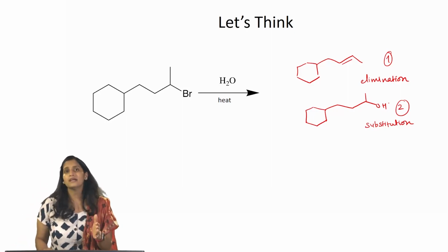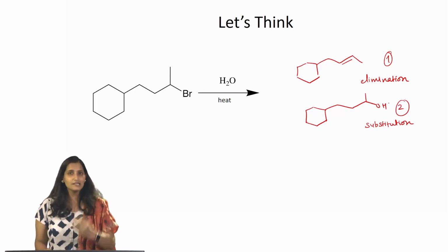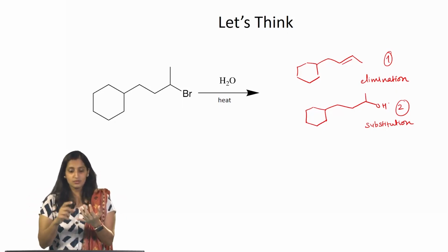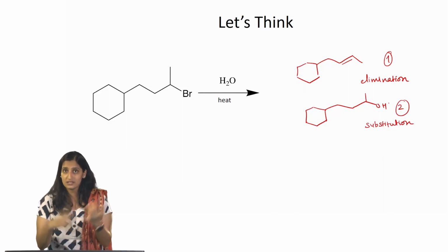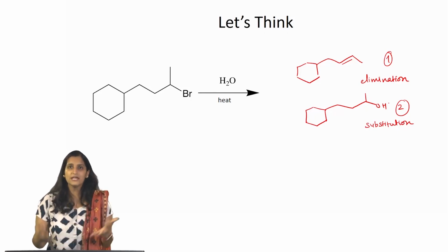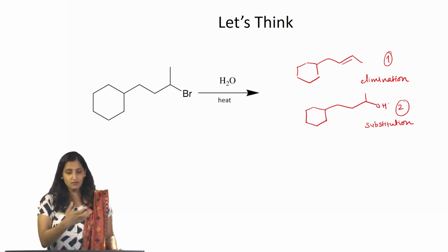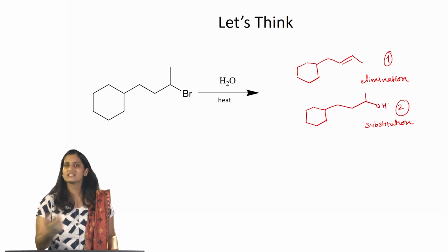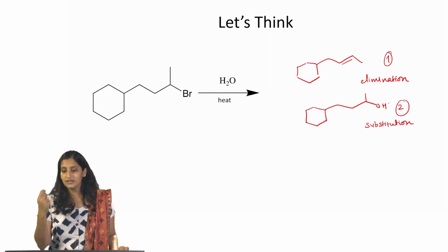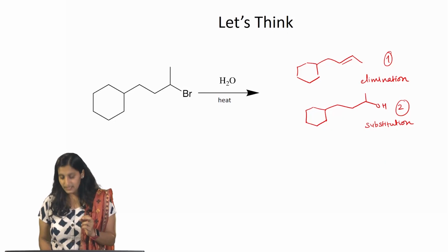But remember that nowadays, since we are synthesizing so many compounds, and literally everything around us is being synthesized, from the food we eat to the drugs and medicines that we take, as well as cosmetics, paints, polymers, everything around us is being manufactured chemically. We want to be sure that we have formed the product that we want, and that's where the role of spectroscopic techniques comes in.